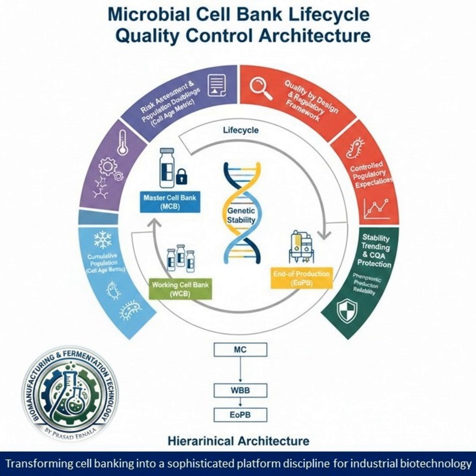You are. You make this bank, you test its performance, and those results are what anchor your maximum cell age specifications. You're basically asking the cells, how far can we push you before quality drops off? And the EOPCB gives you the quantitative answer. Exactly. It demonstrates that your productivity, your growth rate, your impurity profiles, all of it holds up even under that worst-case aging scenario. It's the ultimate preventative control. It defines your operating space.